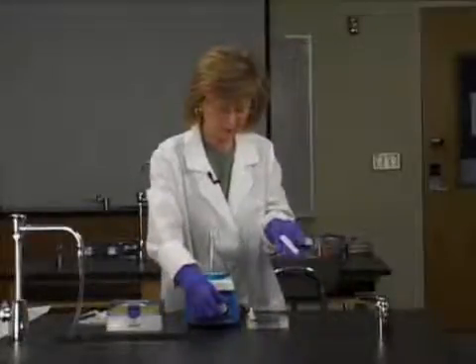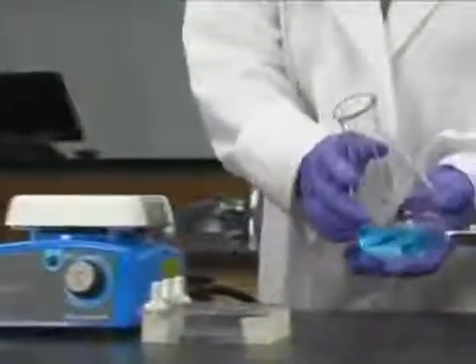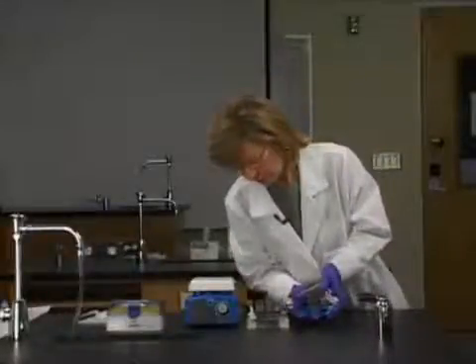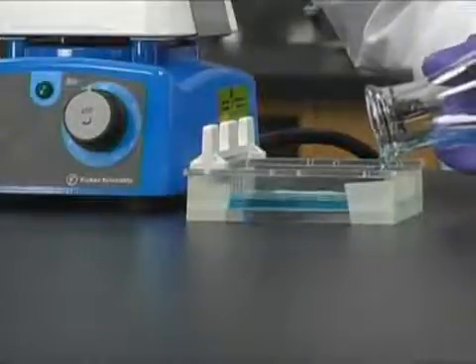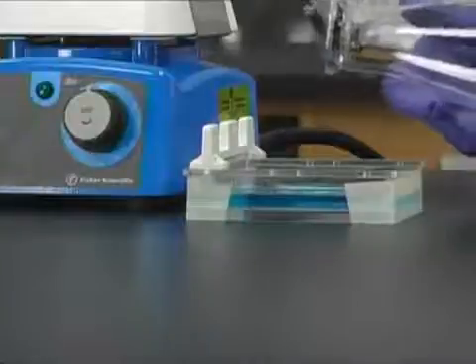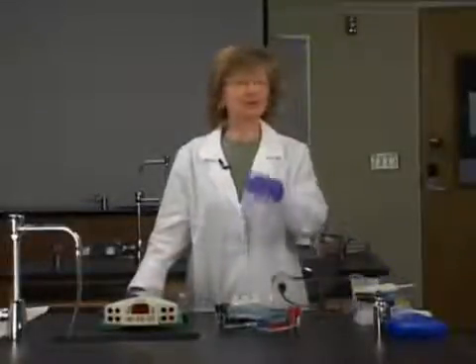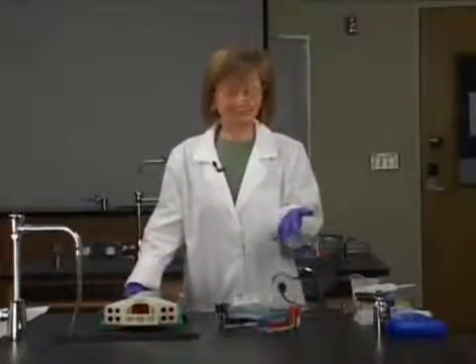So we're going to take a couple of large magnetic stir bars to anchor the small one that's inside. And now we're going to slowly pour this agarose gel into the mold. And that'll take 20 or 30 minutes to set. So this 0.8% regular agarose gel took 20 or 30 minutes to set or harden.